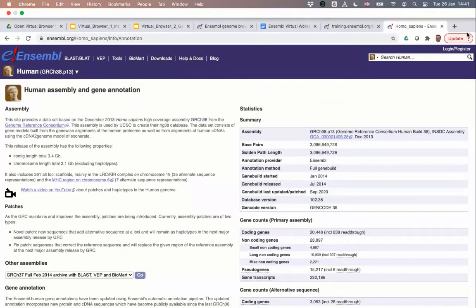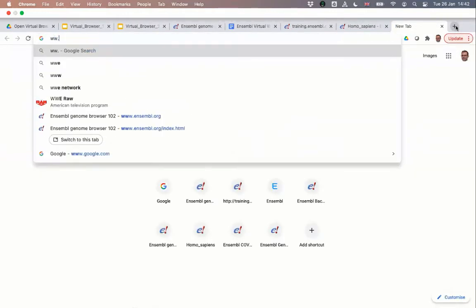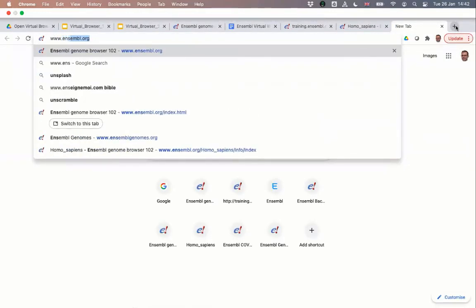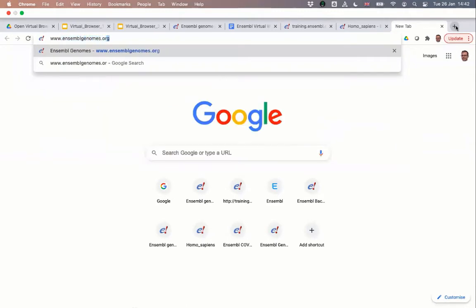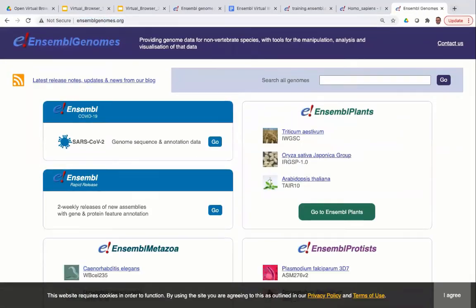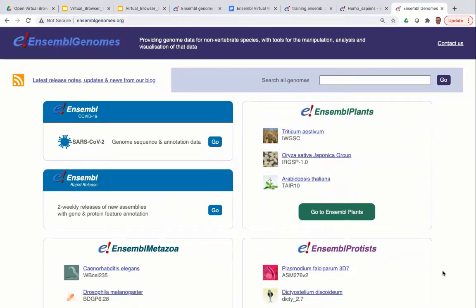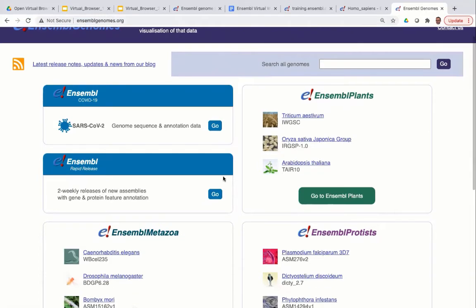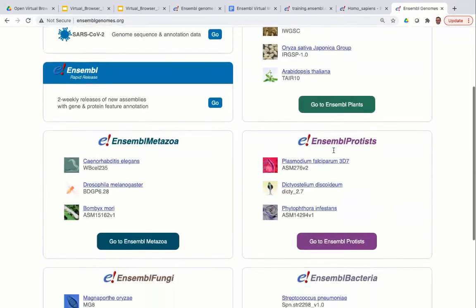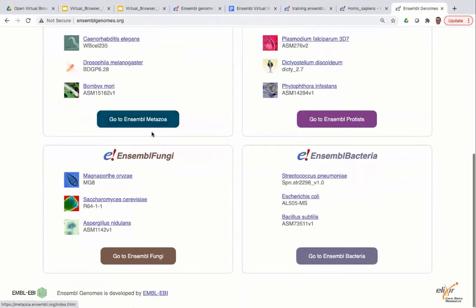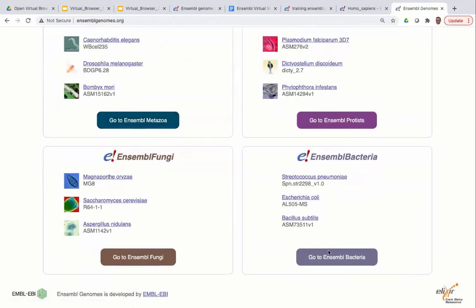Before the first exercise session, I want to show you the Ensembl Genomes pages. Open a new browser tab and type www.ensemblgenomes.org. This takes you to our homepage for non-vertebrate species. Here you can see a link to the Ensembl SARS-CoV-2 genome browser, as well as Ensembl Plants, Protists, Metazoa, Fungi, and Bacteria.